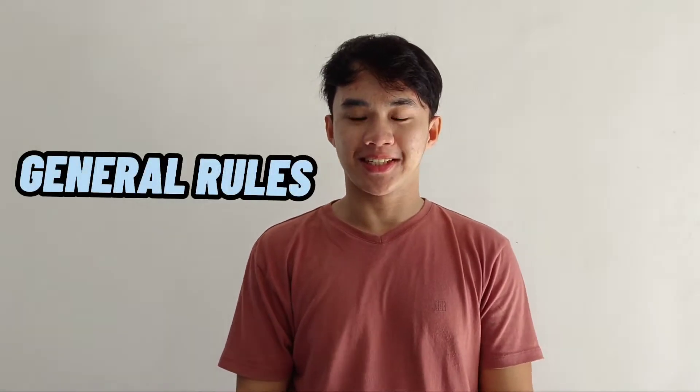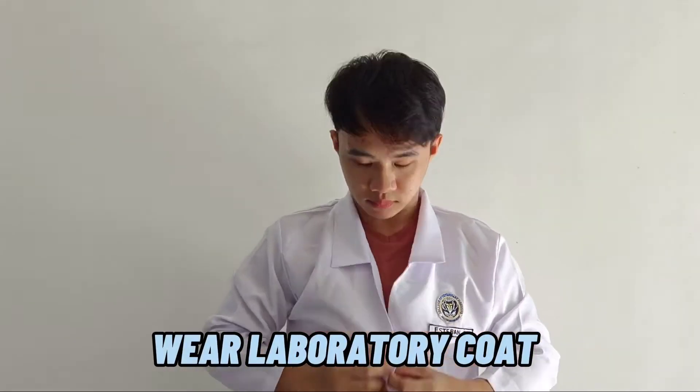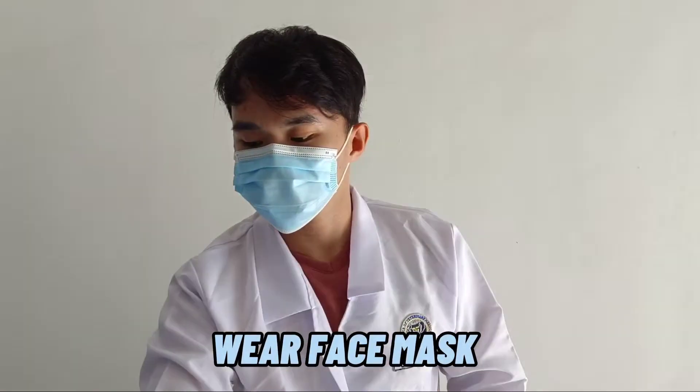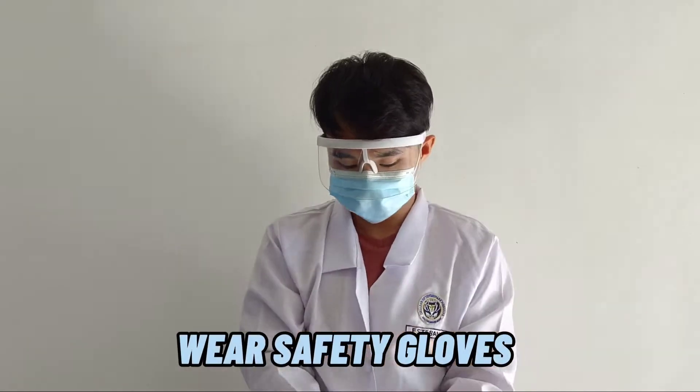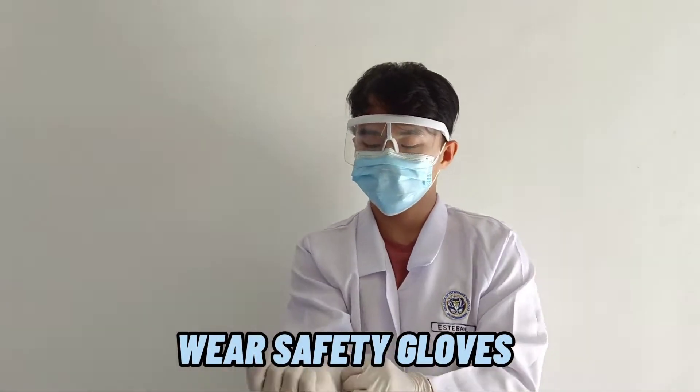Hi! I'm Ryan and these are the general rules. Wear laboratory coat, wear face mask and safety goggles, and lastly, wear safety gloves. We are ready to do the Aseptic Transfer of Cultures.